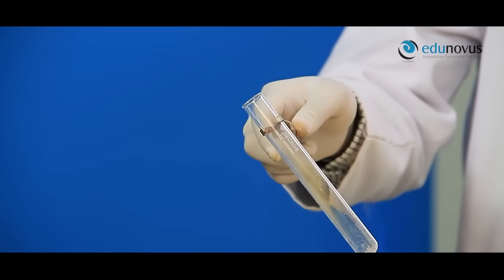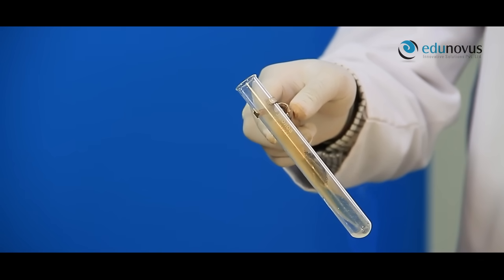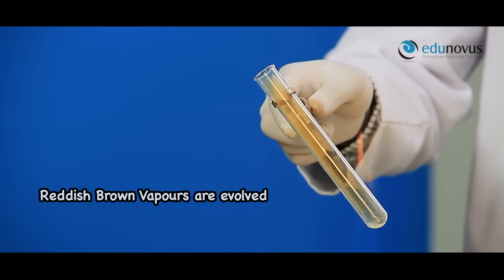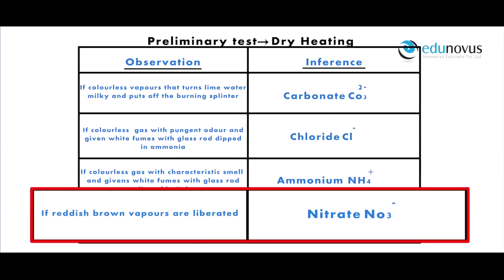If reddish brown vapors are liberated, it infers that the salt may contain nitrate anion. Here you can clearly see the liberation of reddish brown vapors. This test infers that the given salt may contain nitrate anion.